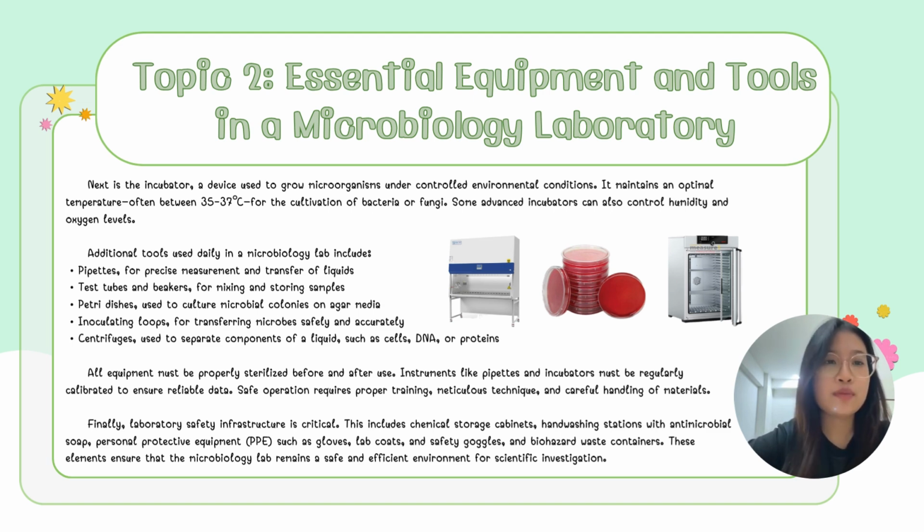All equipment must be properly sterilized before and after use. Instruments like pipettes and incubators must be regularly calibrated to ensure reliable data. Safe operation requires proper training, meticulous technique, and careful handling of materials. Finally, laboratory safety infrastructure is critical.